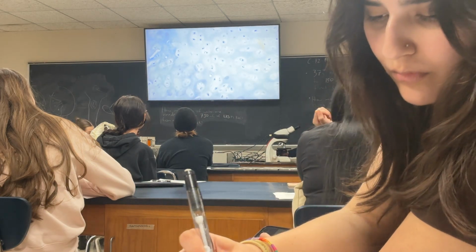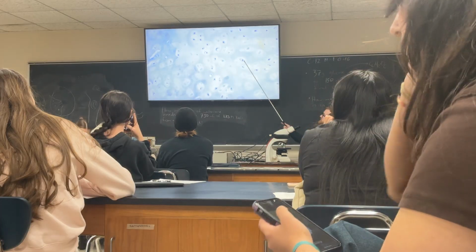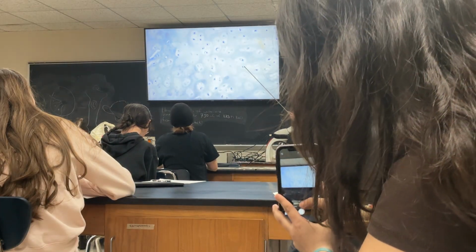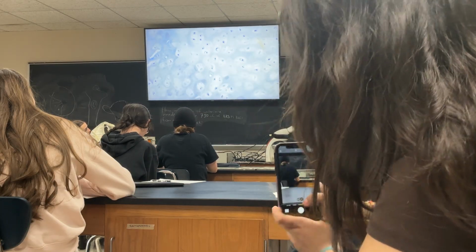Okay, what type of tissue do you think this is? So these are lacuna. You kind of see the little white halo around this cell. That's an empty space called lacuna. So this is either cartilage or bone.